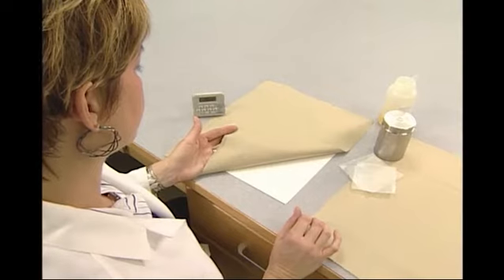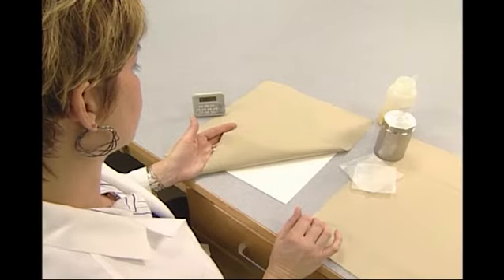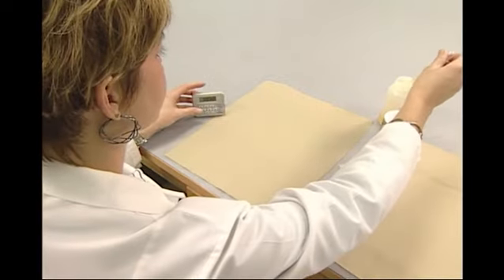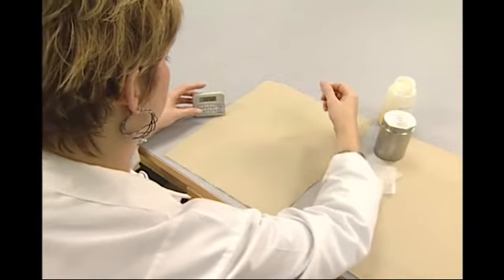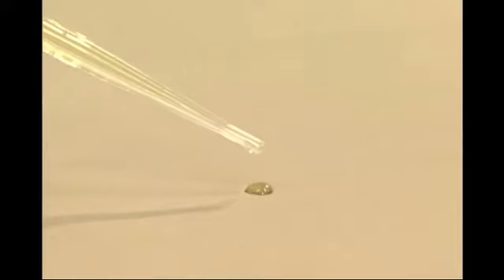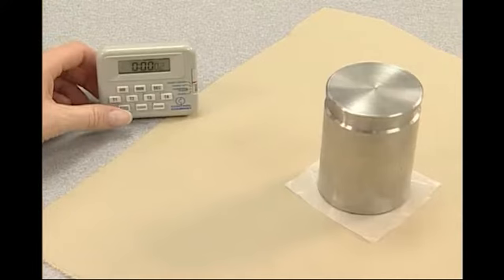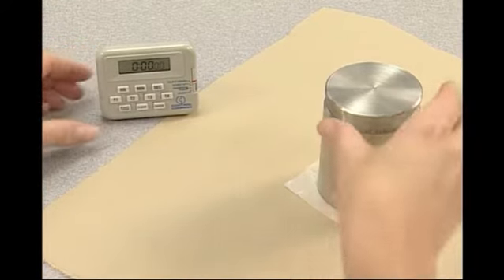The stain release test method is performed by placing a 38 by 38 centimeter fabric specimen on top of a standard blotting paper placed on a flat horizontal surface. Using a medicine dropper, 5 drops of corn oil are delivered to the approximate center of the test specimen. Next, an 8 by 8 centimeter piece of glassine paper, lab-grade wax paper, is placed on top of the oil. Then a 6.4 centimeter diameter, 2.2 kilogram weight is placed on top of the glassine paper over the location of the oil. After 60 seconds, the weight and glassine paper are removed.